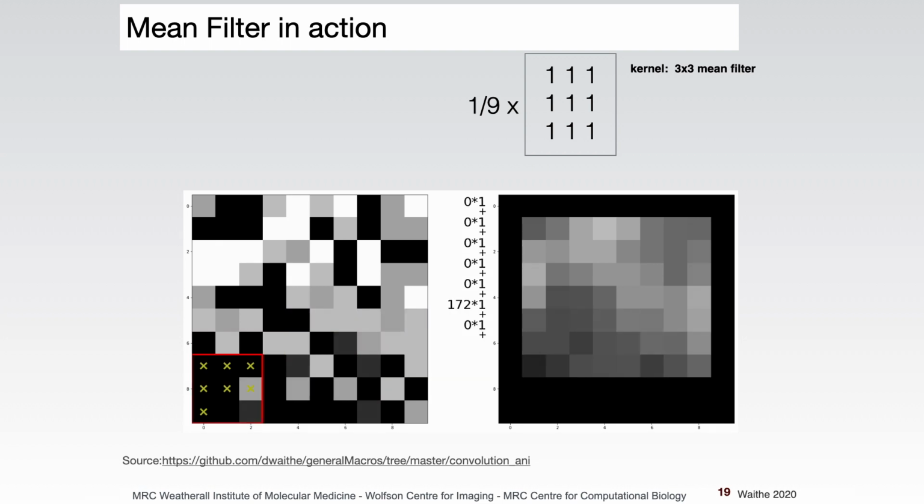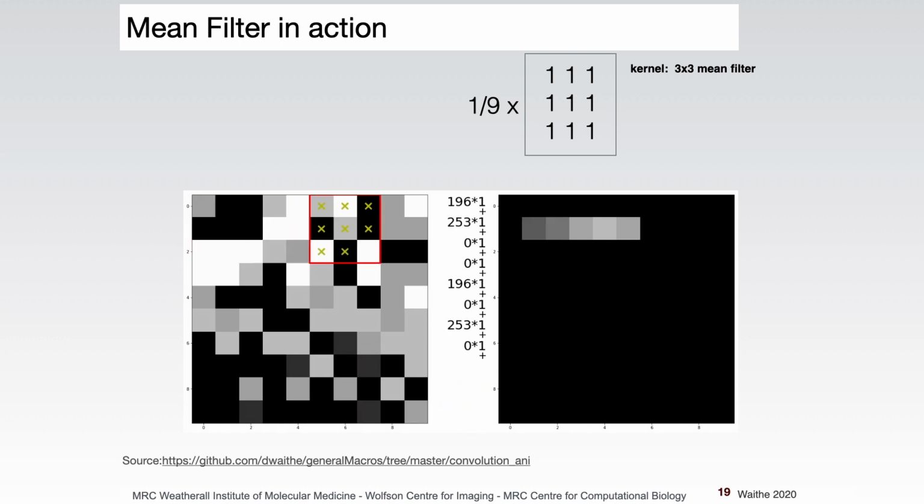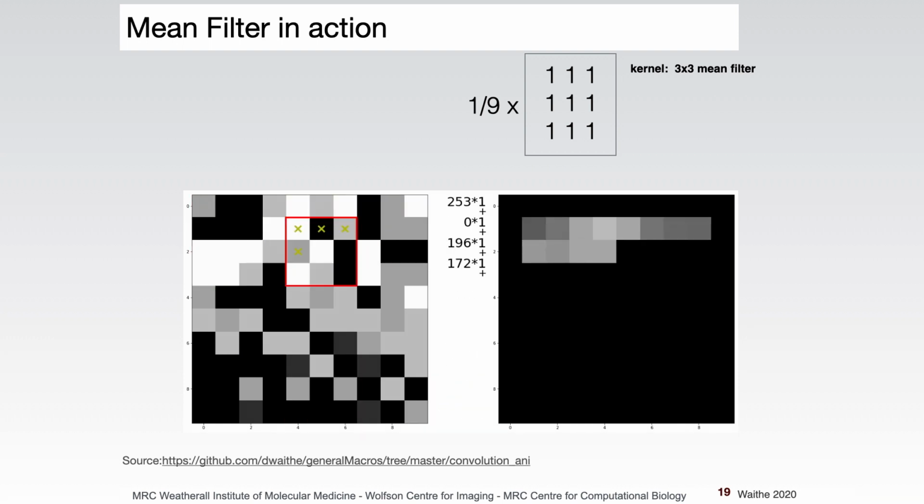You might have guessed I like making little animations. Okay. So that is a mean filter, and that's the most basic filter you can have.